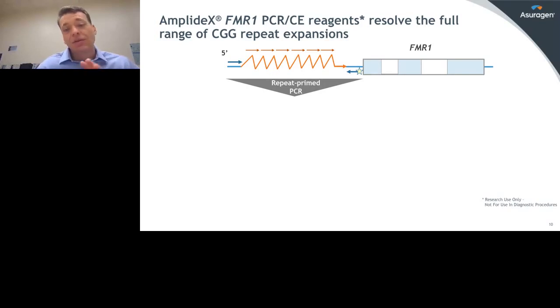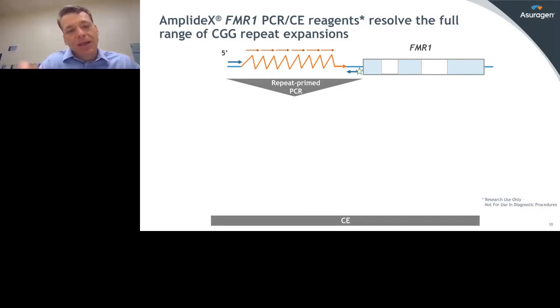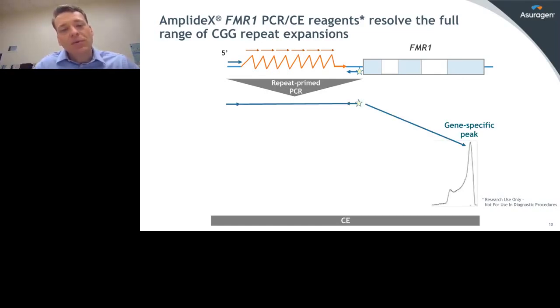So just to give you an overview, the way we do this is we have a 3-primer design. We have 2 outward gene-specific primers, one of which is labeled with a fluorophore so we can resolve it on a platform downstream. And then we use a 3rd primer, which is a repeat primed element. So this is a primer that's complementary to the CGG repeat. It lays down and binds to each and every one of these repeat elements and combines with a reverse primer to create a multiplicity of products that can be resolved.